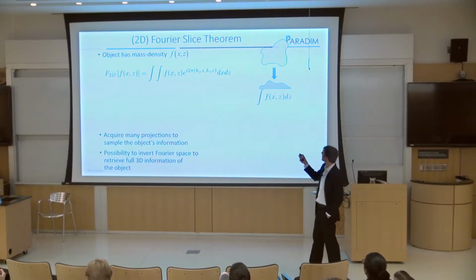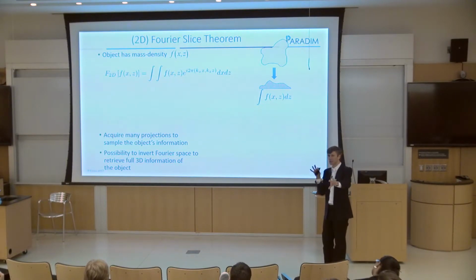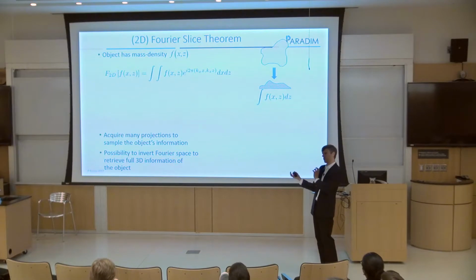So doing that projection is one way to do things. But what we're actually going to be doing is, you can think of things in terms of density in real space, but you can also think of things in terms of frequency in Fourier space. There's not just a 2-dimensional Fourier transform, there's a 4-dimensional Fourier transform. You can do it as many times as you want.